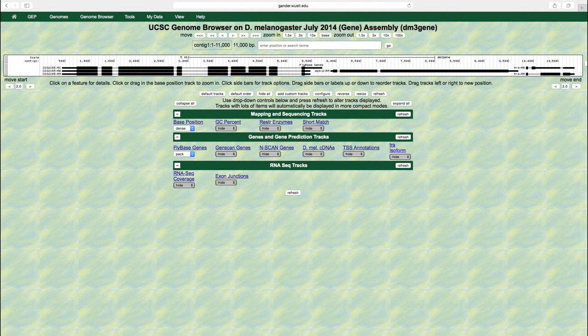The fly-based genes track shows the D. melanogaster genes on the PAC display mode. With this view, we can see the gene and isoform names to the left of each feature. Many evidence tracks have different display modes that you can use to control how the UCSC genome browser renders overlapping features.